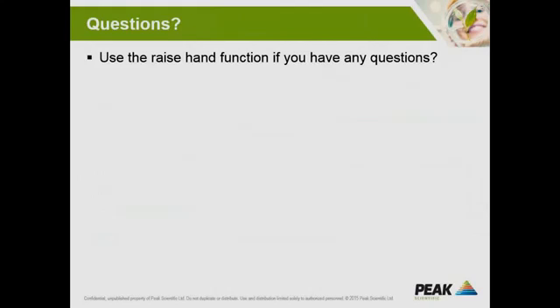I can see. Hello. Hey, Dr. Red, thank you very much. It was quite informative. I just have a couple of questions here, which were mailed to me from one of our customers. It says, what's the consumable need for the generator? So he's actually talking of a stack. He wants the hydrogen, air, and nitrogen gas. So he's asked for the consumables that would be required for the generator for 3 years.